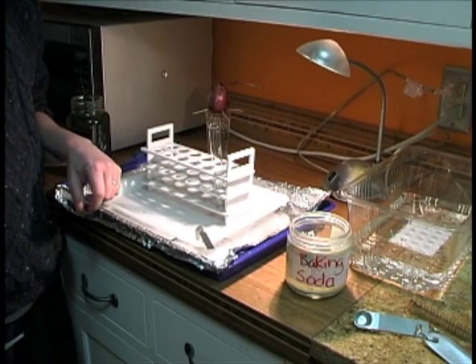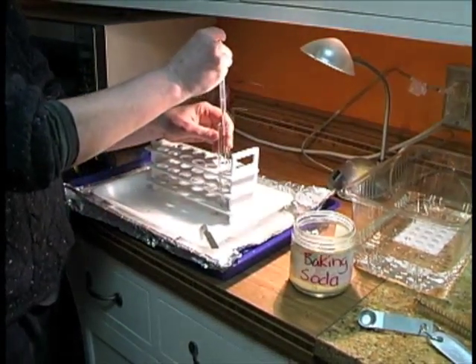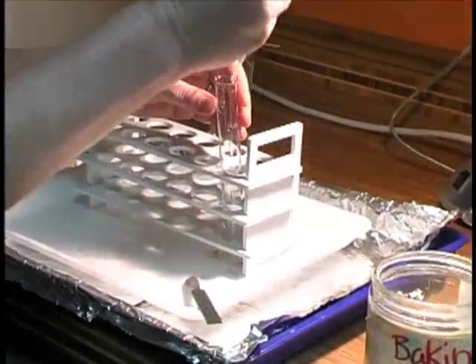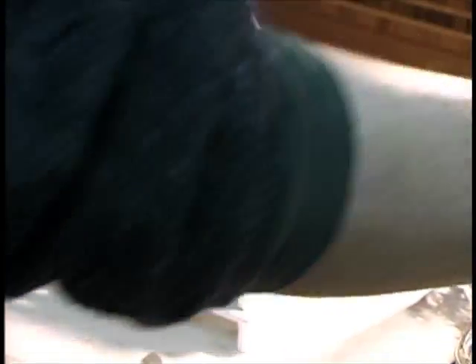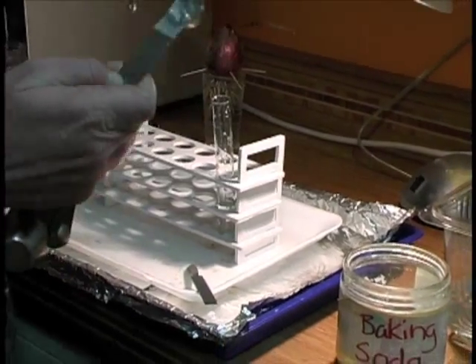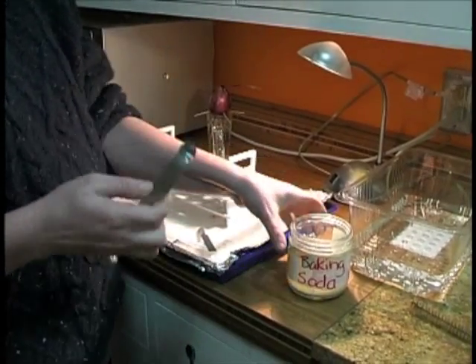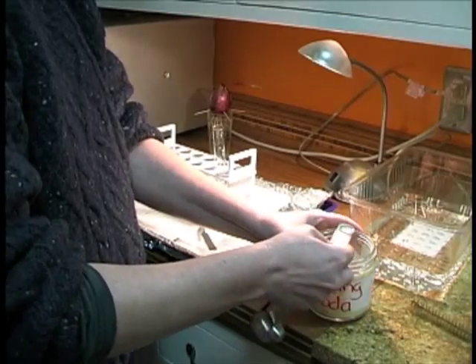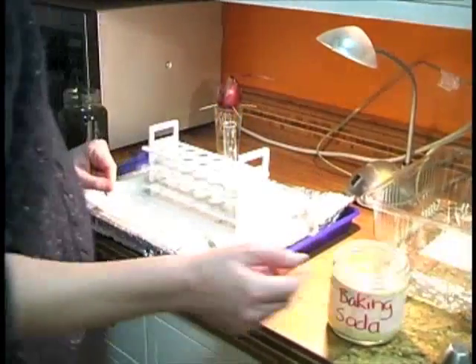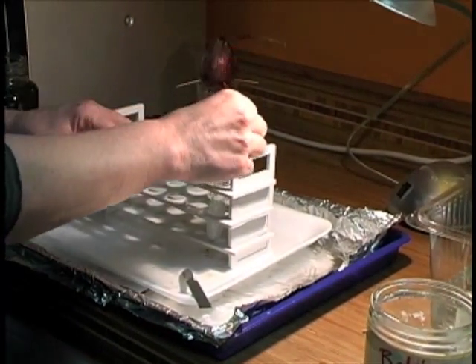To set up for the rate of photosynthesis lab, I'm going to need some dechlorinated water that I've let sit out overnight. I'm going to take a pipette and fill my test tube half full. Then I'm going to take an eighth of a teaspoon of baking soda — I'm using a quarter teaspoon filled half full since I don't have an eighth of a teaspoon. I'm putting the baking soda into my test tube and mixing it up, then adding a little bit more water.